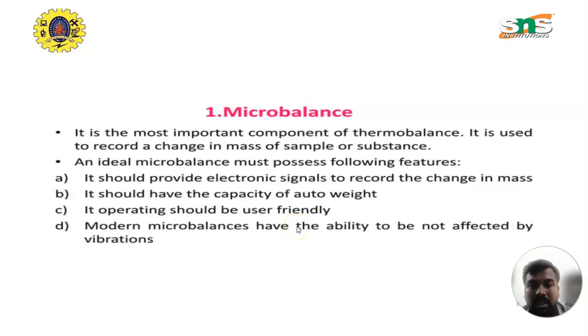Hello everyone. The continuation of thermogravimetric analysis. The thermogravimetry analyzer consists of the following many instruments. Let us discuss one by one.